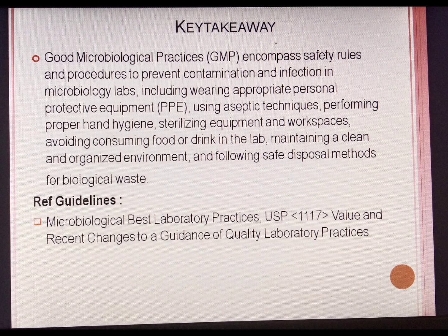Key takeaway. Good microbiological practices encompass safety rules and procedures to prevent contamination and infection in the microbiology lab, including wearing appropriate PPEs, using aseptic technique, performing proper hand hygiene, sterilizing equipment and workplace, avoiding consuming food or drink in the laboratory, maintaining a clean and organized environment, and following safe disposal methods for biological waste.